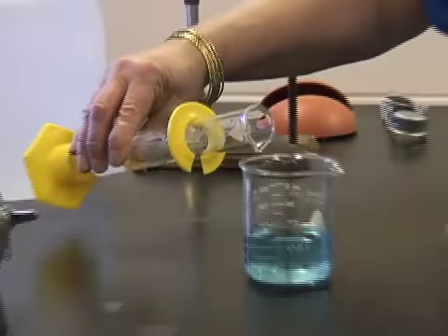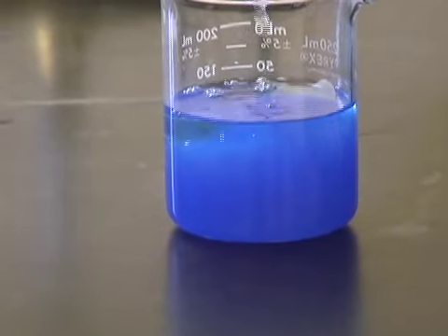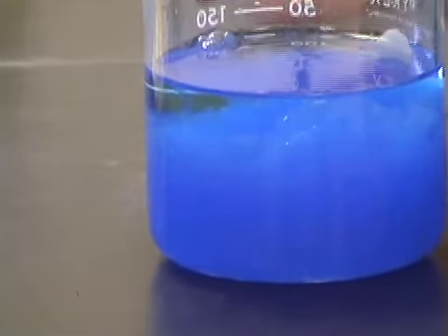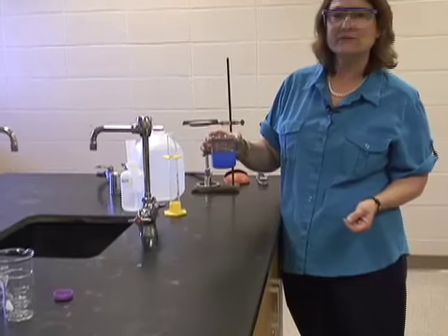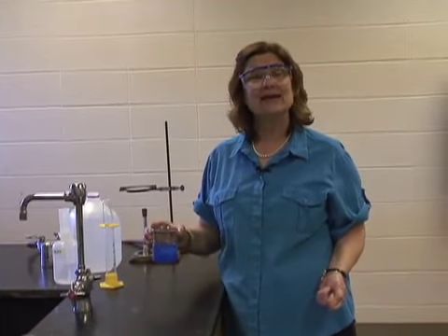And as I add it, you can see what a beautiful reaction this is. It forms like a gel, a royal blue gel precipitate. And it's very, very interesting. I can swirl it a little bit, but it seems to be mixed very well. Now I'm going to heat it on the Bunsen burner.